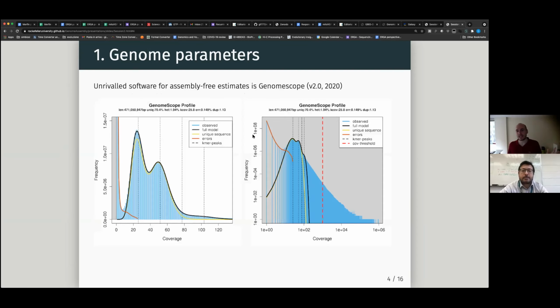So I think Olivier and I have been looking at these plots for years now. Like, yeah, I dream about them. Yeah, exactly. How many of you have seen such kind of plot before? I know Sadie did, but... I haven't.